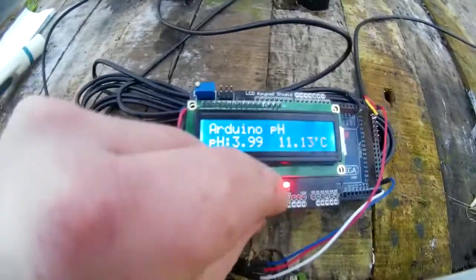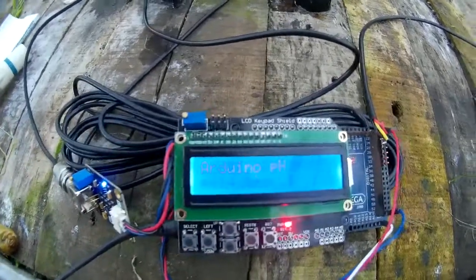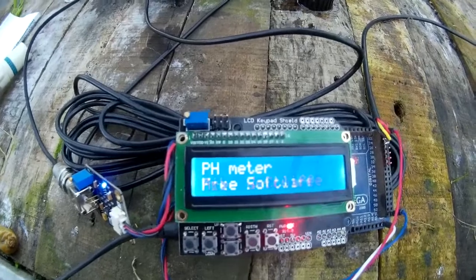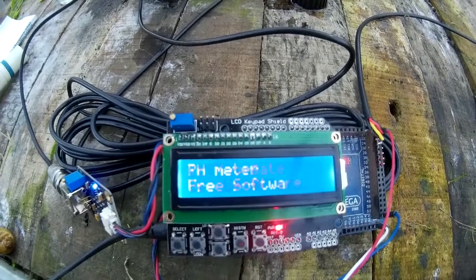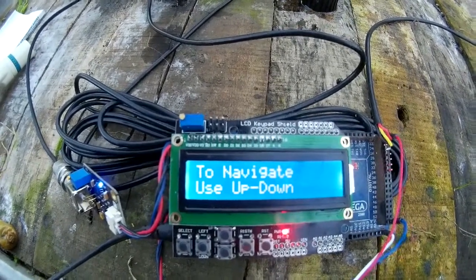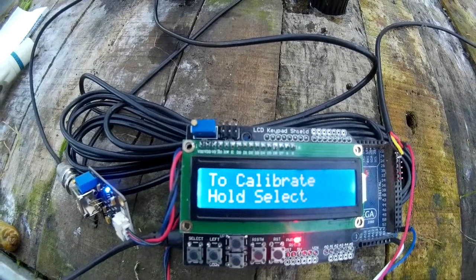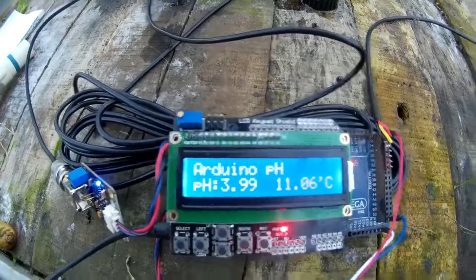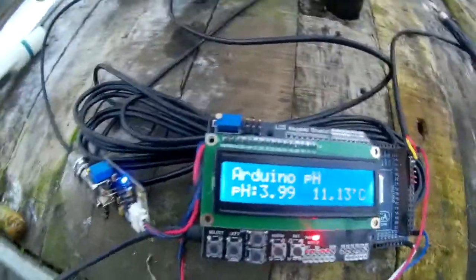Now all these values are saved in EEPROM, so if we reset the controller and keep it in the pH 4, it should tell us it's still in pH 4 because it will hold its calibration even when you power off. It reads 3.99 — that's because of the way we're storing to EEPROM, but it's pretty close as you can see.